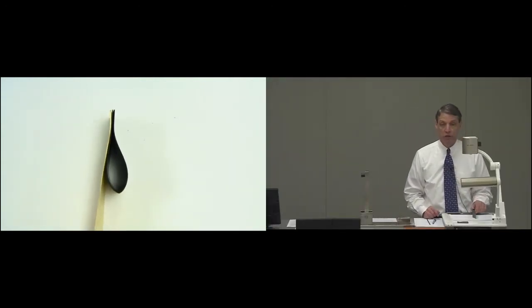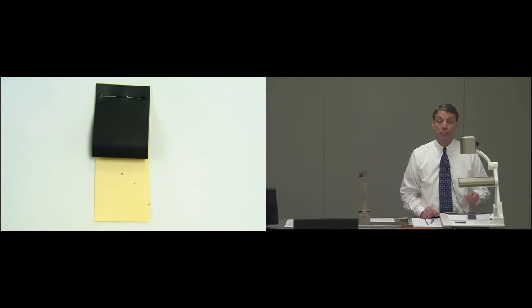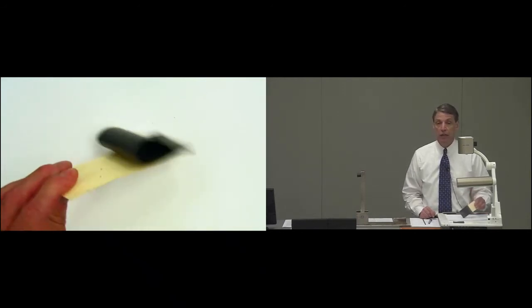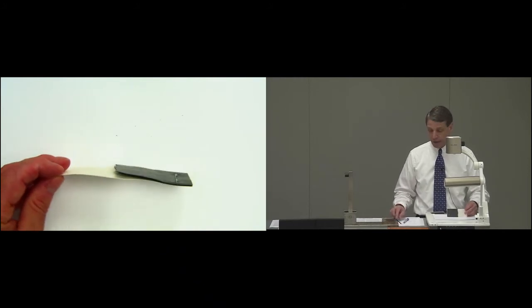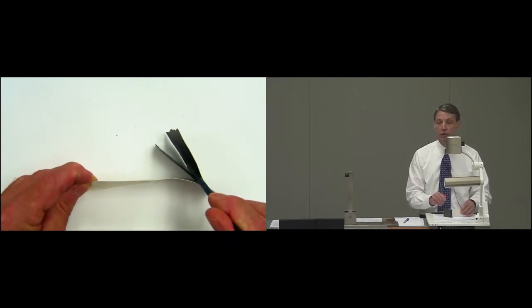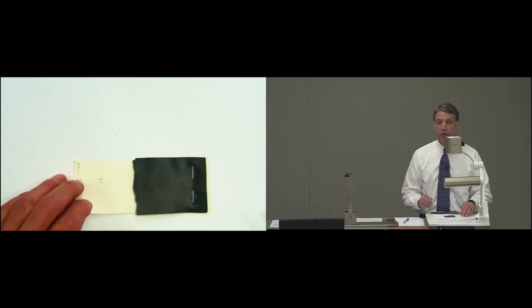You can see the specimen is creased, but it has not failed. And failure is a partial break or failure or a complete failure. This specimen is intact, so this passes the low temperature impact test of ASTM D1790. This specimen did not pass the impact test. You can see that the specimen split. The loop is discontinuous, and so this is a failed specimen after low temperature conditioning.